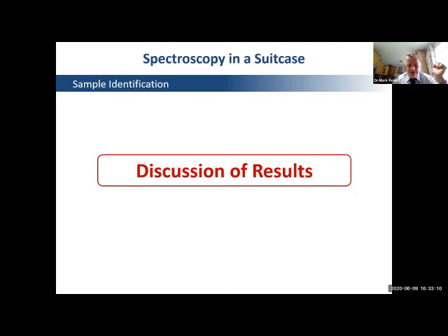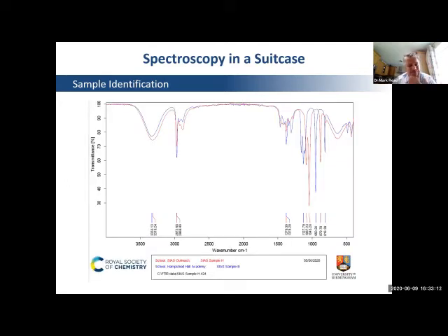And I'm going to run through some of the samples that we had. First of all, we started with sample B, which was clearly an alcohol, because we saw this nice broad OH peak around 3,300, and we didn't observe any carbonyls around 1,700. So we only had the OH. This is actually the CH stretch. We didn't see any carbonyl.